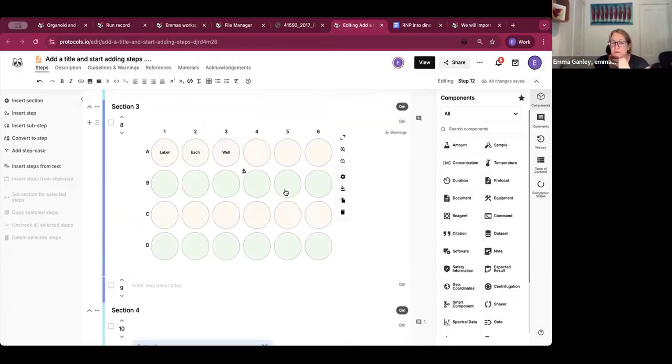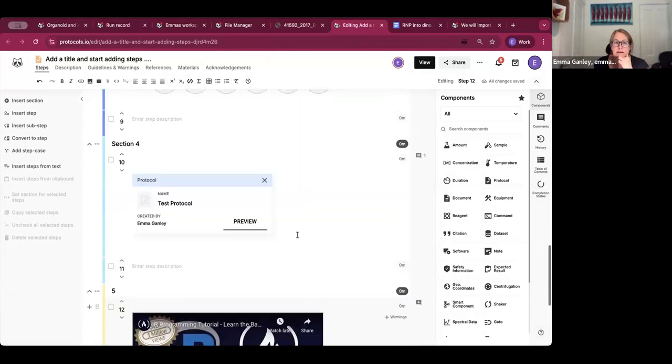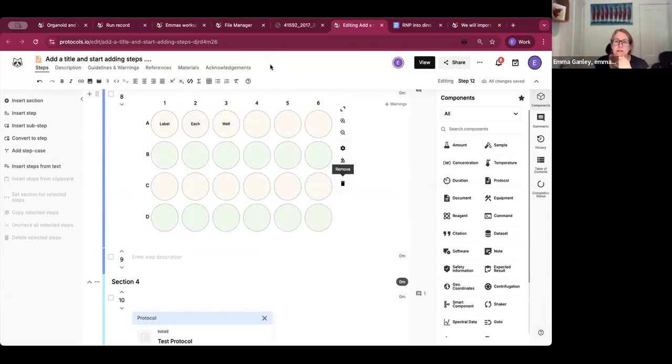Well plate maps if you're doing screening. You can embed sub protocols. So if you've got a buffer recipe or something that needs to be done each time in multiple different scenarios, you can make a small protocol and then point to that protocol within. So you can have a sub protocol. You can only nest one layer because it becomes too complicated to run otherwise, but you can see a lot of the options and things that are in here. Way more than I can go into now.